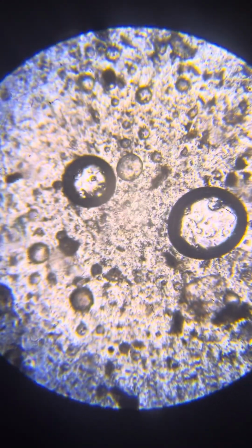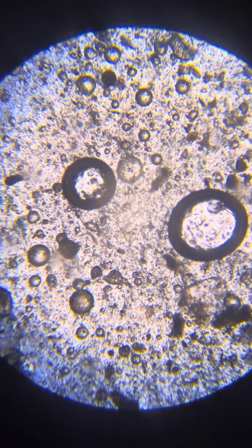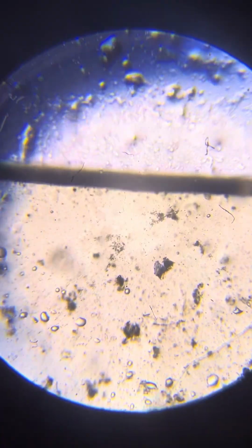These are additional very nice Neros. So okay, I think it's a good, nice slide. Let's take a look at the other two. Each of the three was taken from a slightly different place in a container, so we might get somewhat different results, and also, of course, it's a little bit random.